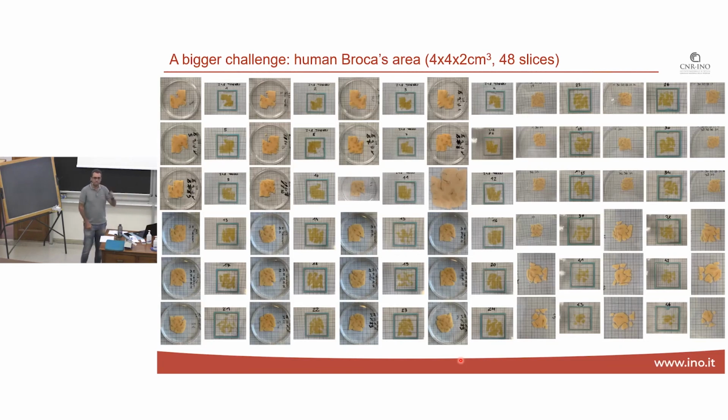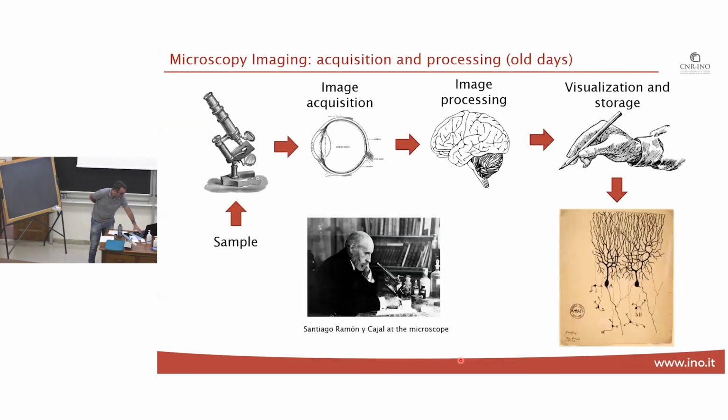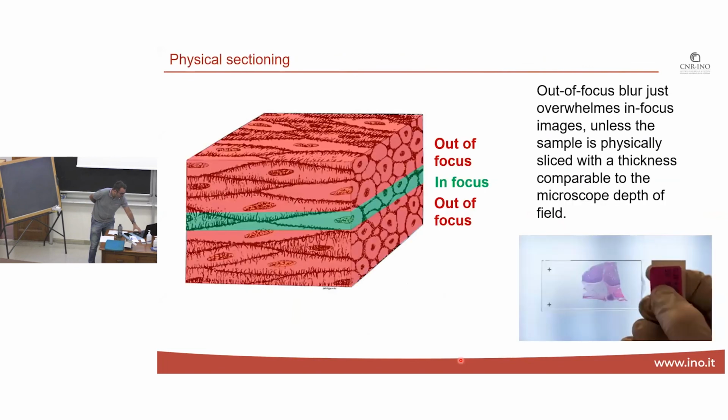There was a nice image that I probably should include in this presentation. Unfortunately, I don't have it here with me, but we did, for example, a three-dimensional portion of a human bladder, and we did that with light sheet microscopy. And we also applied a simple color transformation algorithm to make the acquisition look as if it were stained with the traditional pink and violet stain, hematoxylin eosin. This kind of stain is what anatomopathologists are used to seeing. Pathologists usually look at slices of samples that have been stained with hematoxylin and eosin, which have this pink and violet look. But this is two-dimensional.